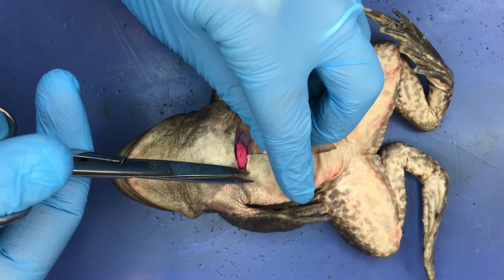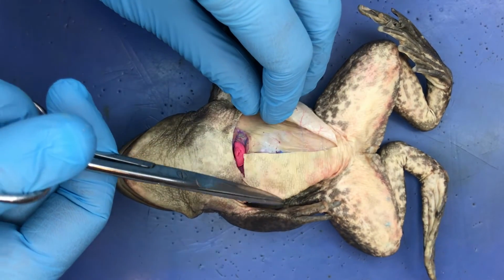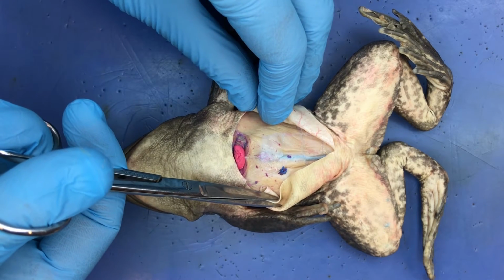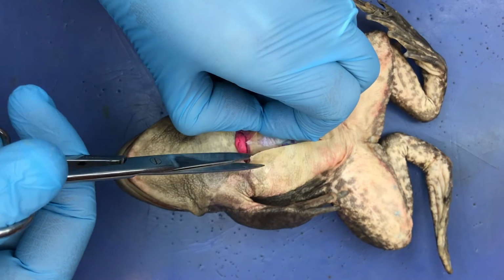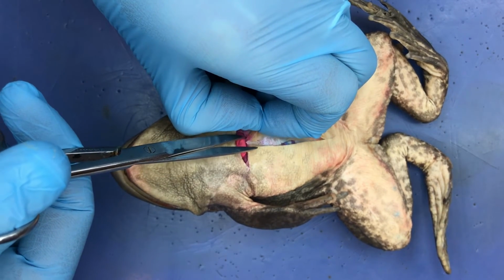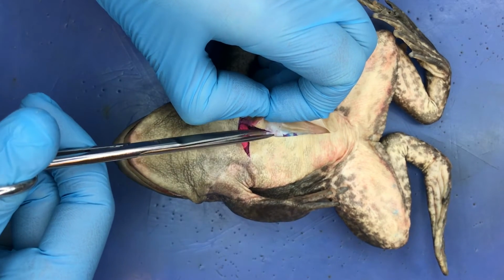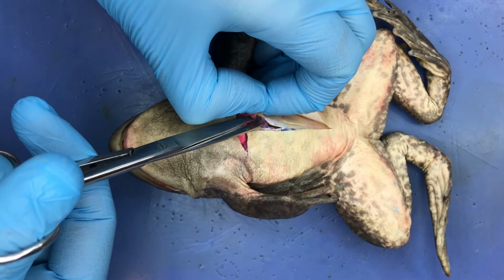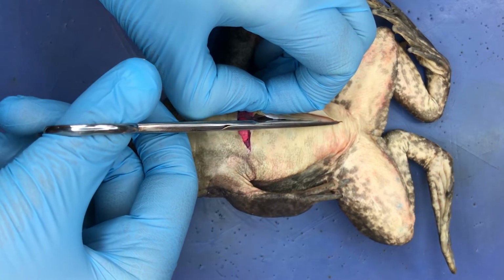Now that we have exposed the muscle underneath the thin skin, we will cut through the muscle to expose the organs within the abdominal cavity, paying careful attention to keep our scissors pointed up as to not damage the underlying viscera.